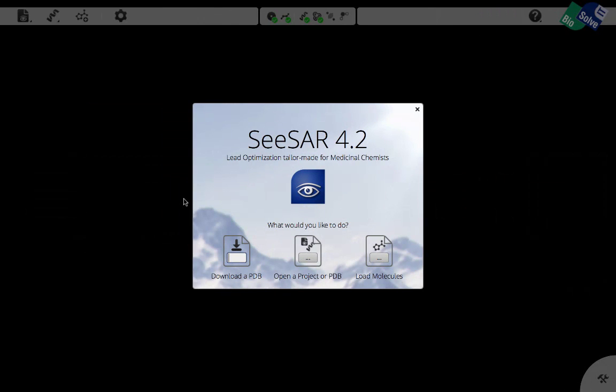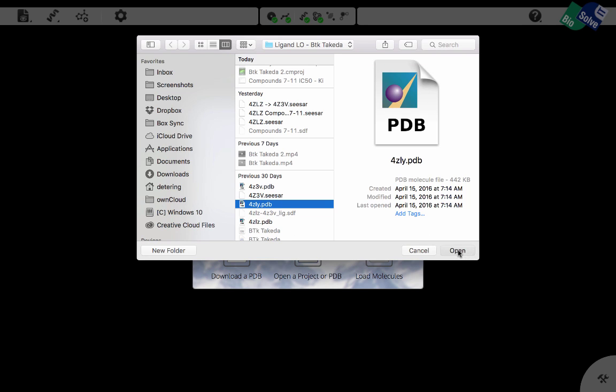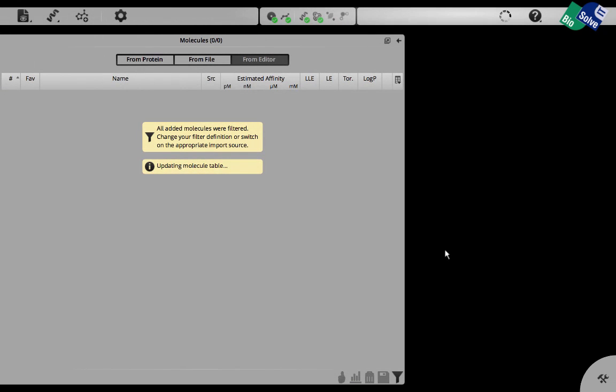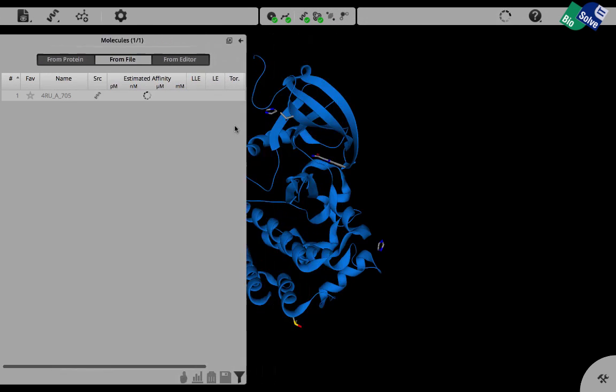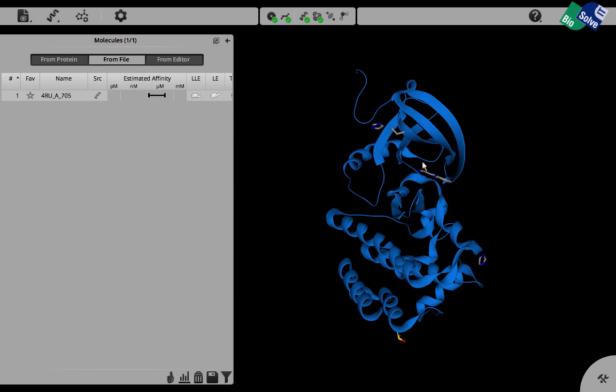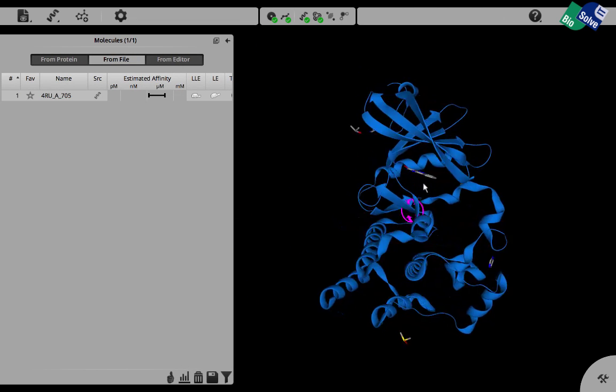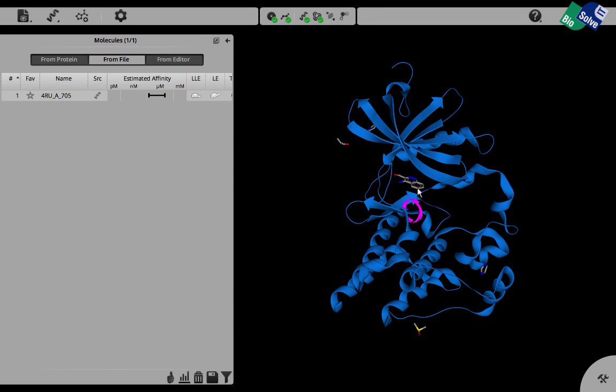Let us start out by loading the crystal structure of the fragment hit they obtained. We can see that the protein is loaded and is shown in its cartoon structure. We can also see where the fragment is situated inside the protein and we can identify this p-loop that we saw earlier in the paper.